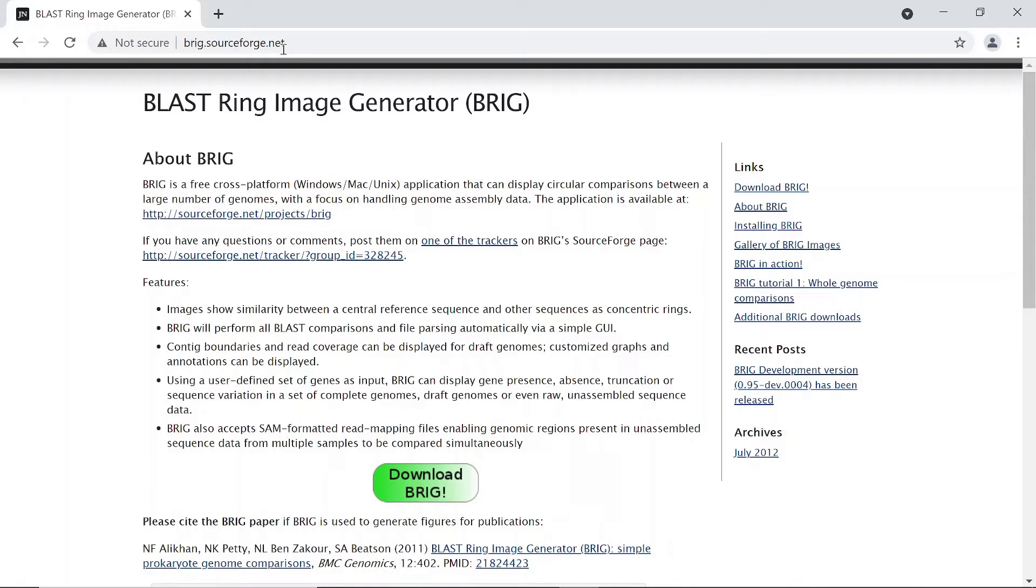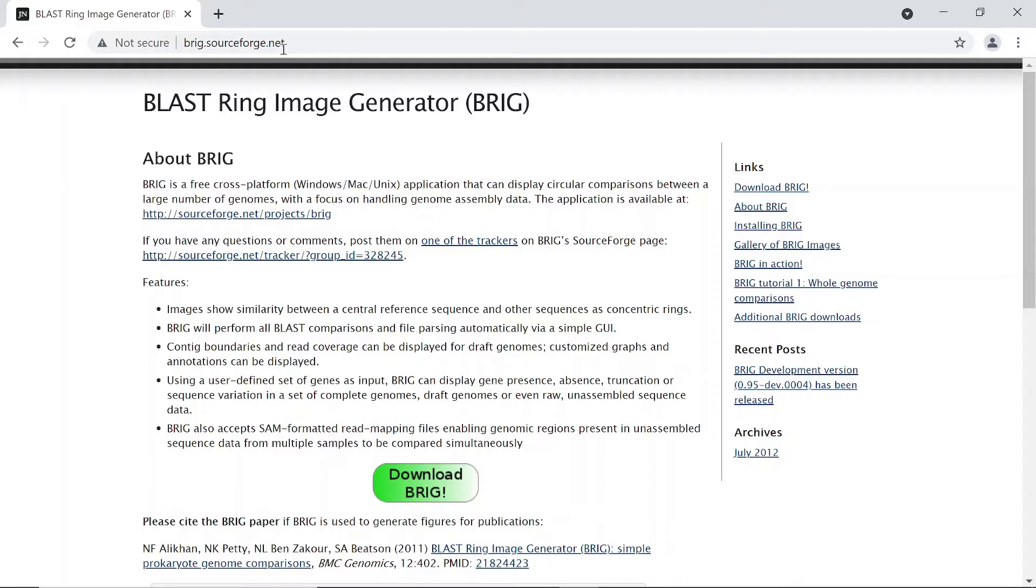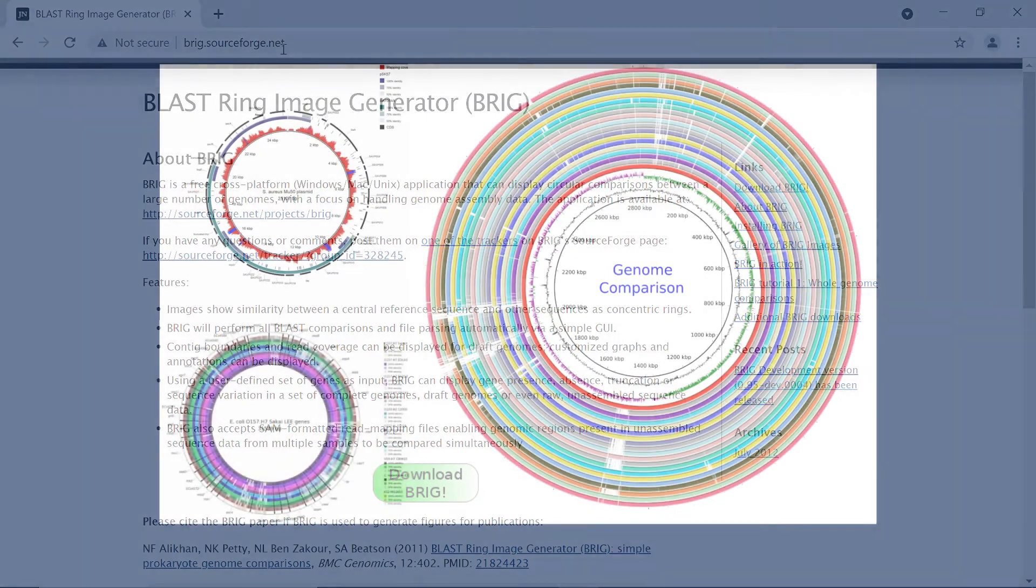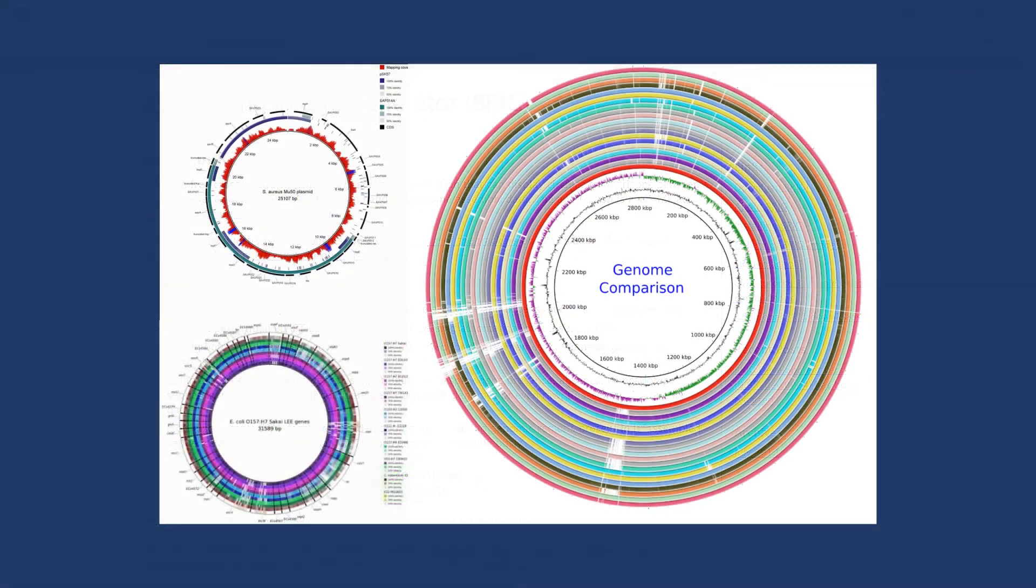Hi everyone, welcome to the Bioinformatics Coach channel. In today's video, I'm going to show you how you can set up the BLAST Ring Image Generator on a Windows machine. BRIG is a tool that is used to compare and visualize genomes in circular or ring structures. Using BRIG, you'll be able to generate these cool plots that I'm showing right now. These are just a few of the plots you can generate using BRIG.